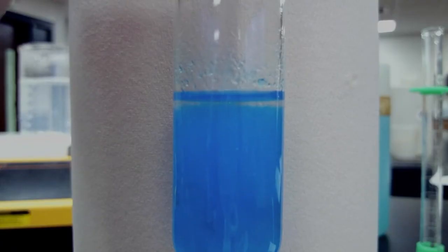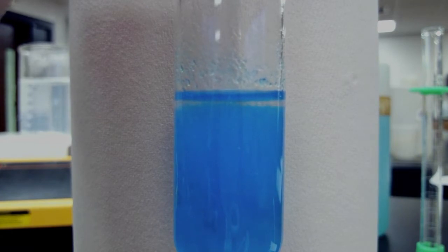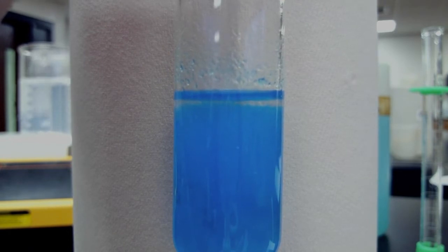You can see that the solid is blue, but if you let the solid settle, the liquid's actually still clear. So I want you to record both of those: a blue precipitate, clear liquid for the observation. Pause the video if you need to.